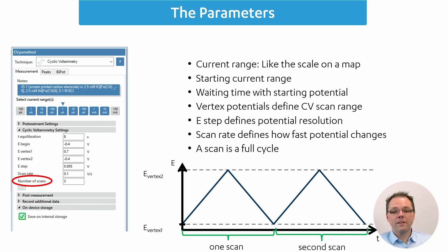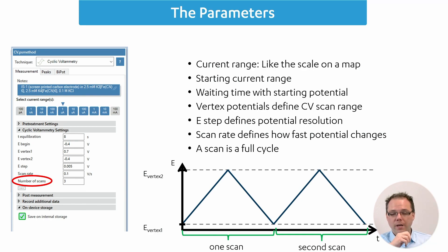The last basic parameter is the number of scans. Going from E-begin to vertex one, vertex two, and back to E-begin is a complete scan, and you can repeat this multiple times. This is interesting for testing how stable your system is, or for people who modify a system with cyclic voltammetry — for example, depositing a polymer to watch it evolve over multiple cycles.